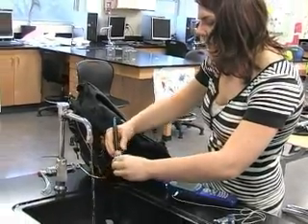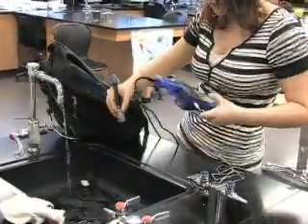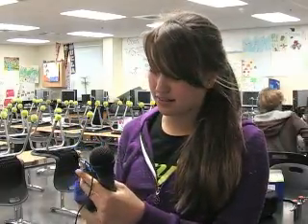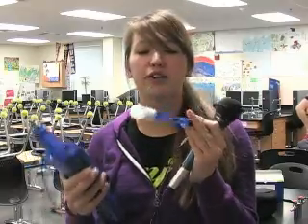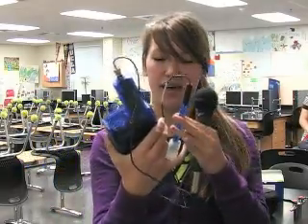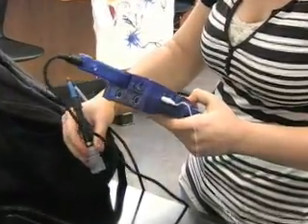So we have a machine like this. This reads all the data. And then we have like 4 plugins right here where we plug these little readers in, and this one reads pH, so you put the water in this, and this little data stick reads the pH, and we have a bunch that read dissolved oxygen, pH, phosphate, nitrate, temperature, and turbidity.